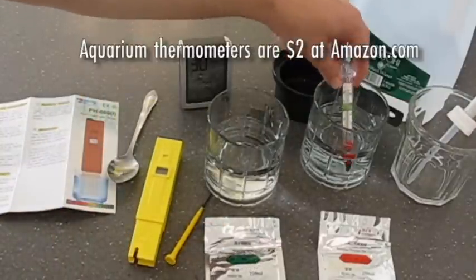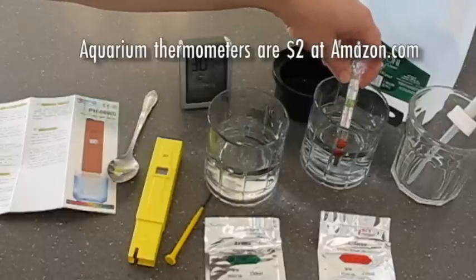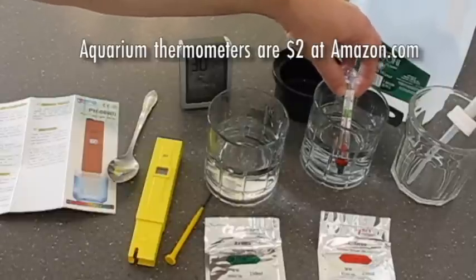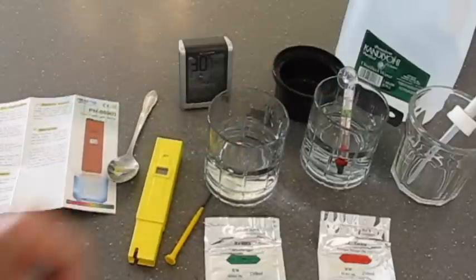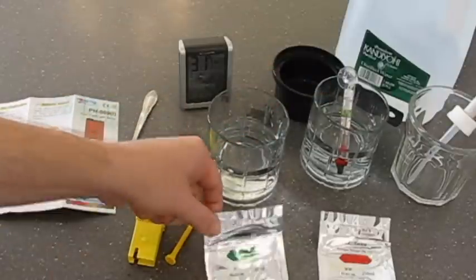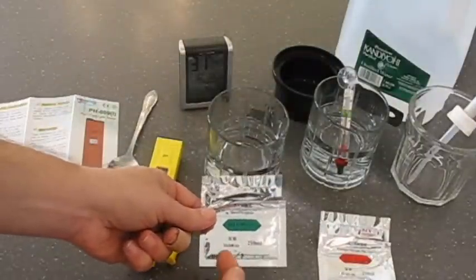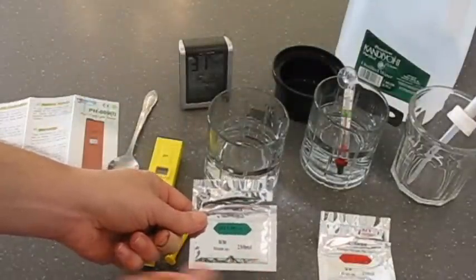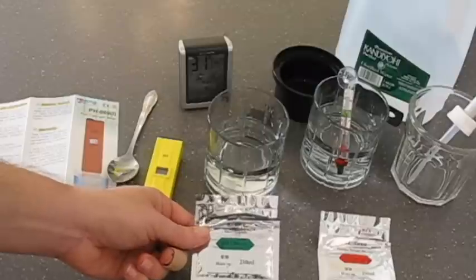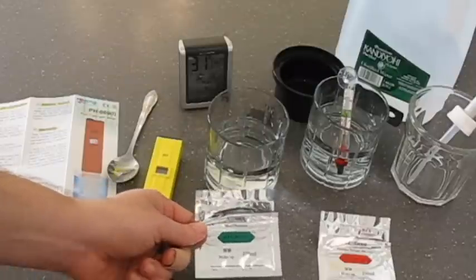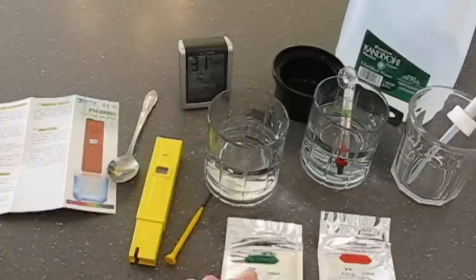So what I have here is I have a thermometer that's normally used in fish tanks, and I have two glasses of distilled water. This doesn't explain it, but from what I have figured out, it says make up 250 milliliters. What that means is mix this with 250 milliliters of water. 250 milliliters of water is roughly one cup of water, so I have one cup of water in each glass here.